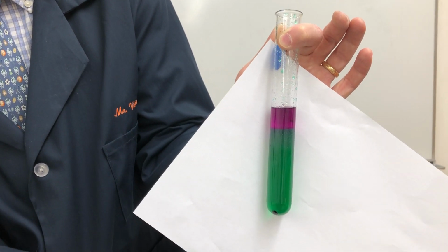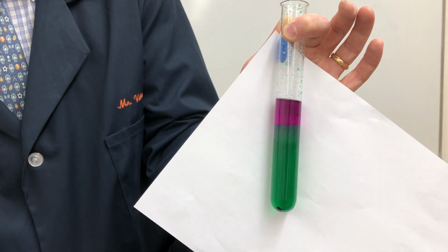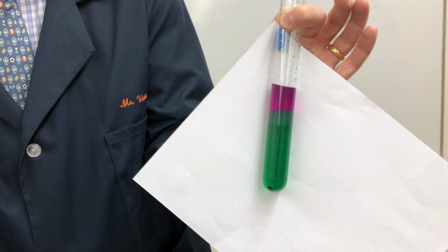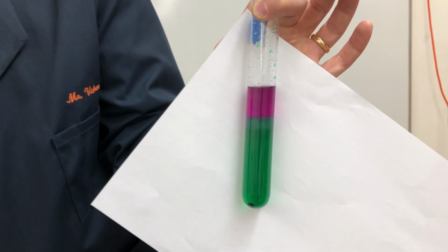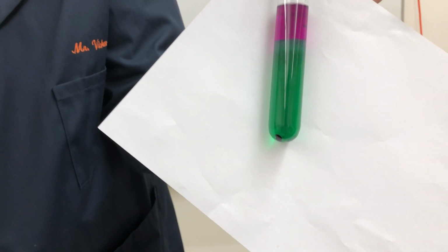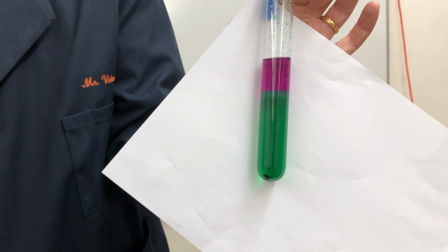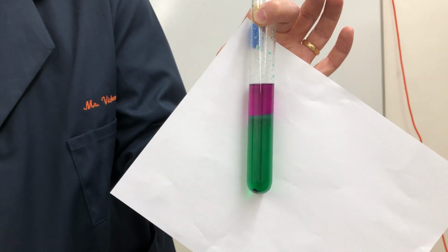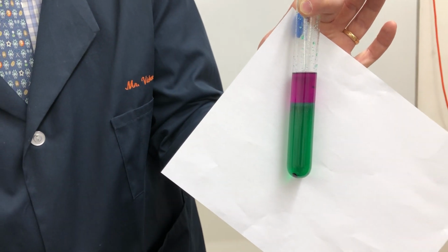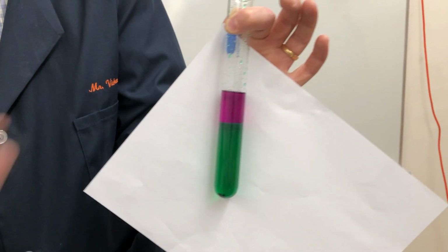So we still have some iodine in the bottom there, but iodine dissolves better in the hexane layer than it does in the water. That doesn't mean it doesn't dissolve in the water at all, but it has a very low solubility in the water. Those of you who are campers or backpackers may have used iodine tablets to purify water before. The iodine tablets that you dissolve in the water do dissolve a little bit and disinfect it, but they do not have a very high solubility in water. But the iodine does dissolve nicely in the hexane there.